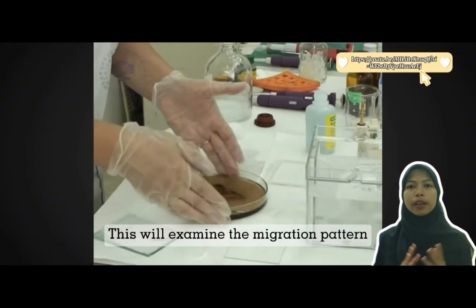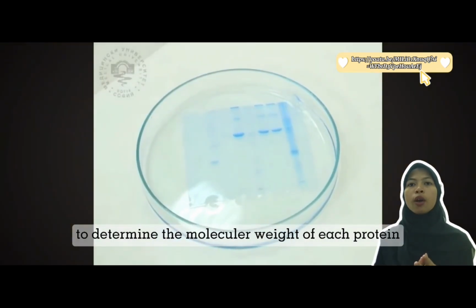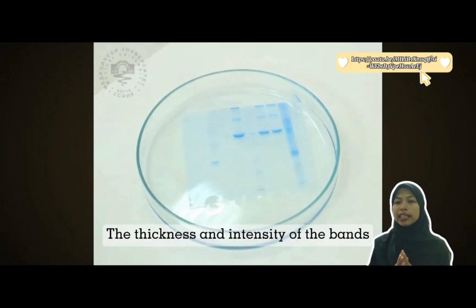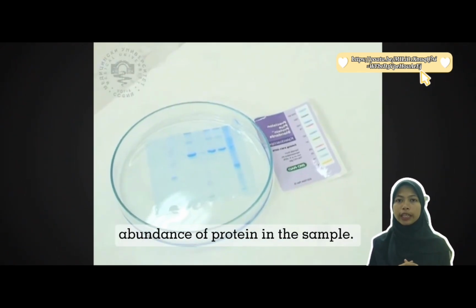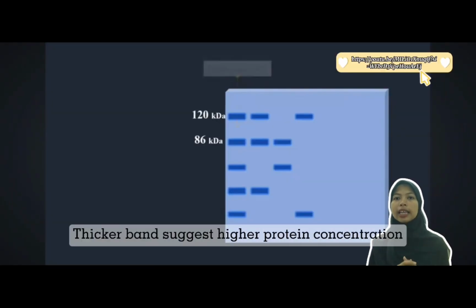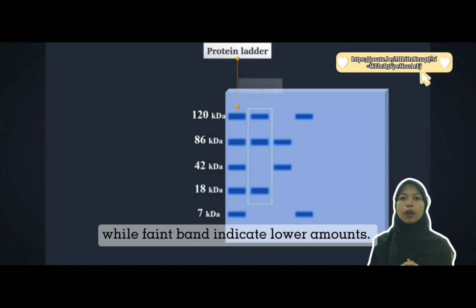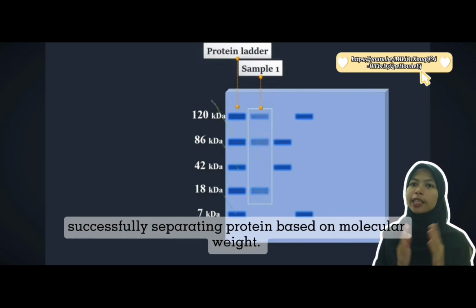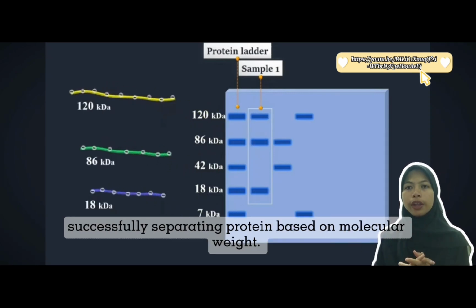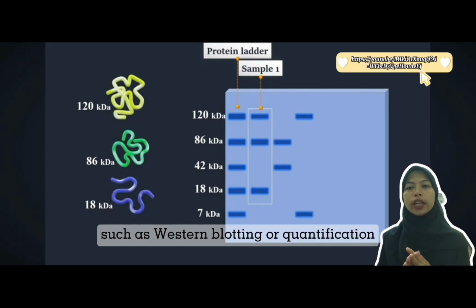We can then examine the migration pattern and compare the bands with the protein ladder to determine the molecular weight of each protein. The thickness and intensity of the bands indicate the relative abundance of protein in the sample. Thicker bands suggest higher protein concentration, while faint bands indicate a lower amount. This marks the completion of the SDS-PAGE process, successfully separating protein based on molecular weight. Now, we can proceed with further analysis, such as Western blotting or quantification.